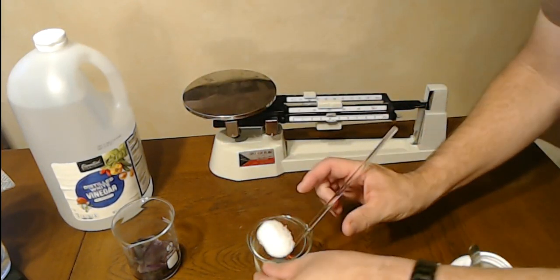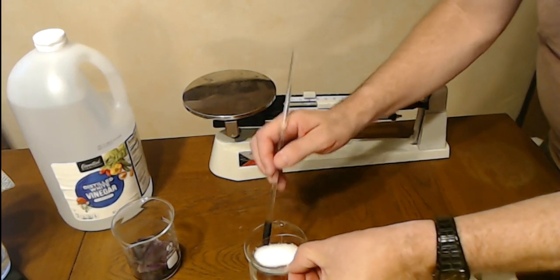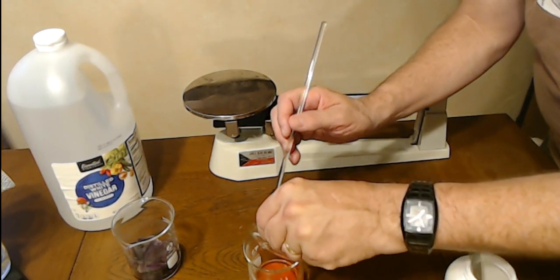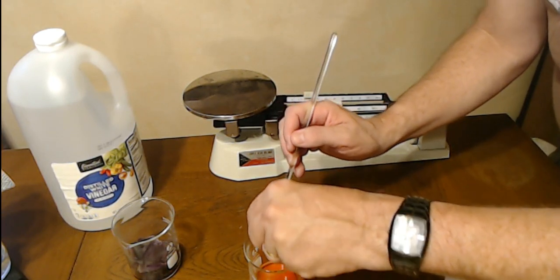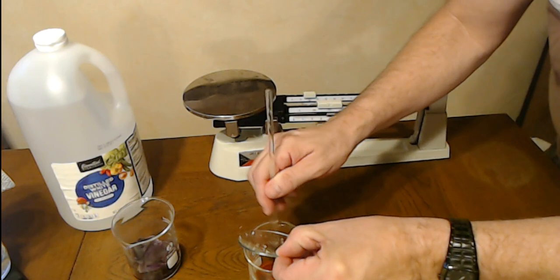Now I'm just going to pour. I don't care if all the lye ends up in, but I want most of it in. Maybe tease a little off here. Any lye left over is just going to stay on there. We're going to spread it up.